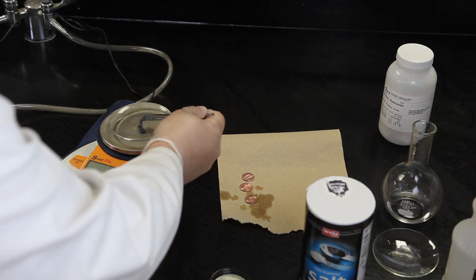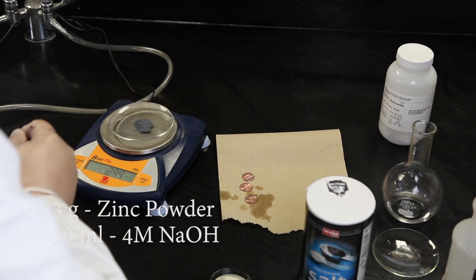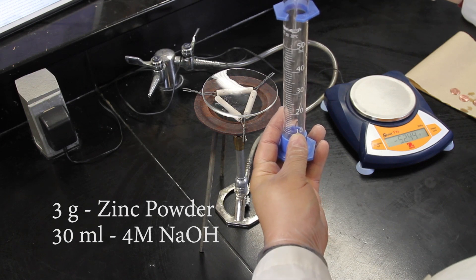To prepare the electroplating solution, add 3 grams of powdered zinc to 30 milliliters of 4 molar sodium hydroxide in a Pyrex beaker or evaporating plate.